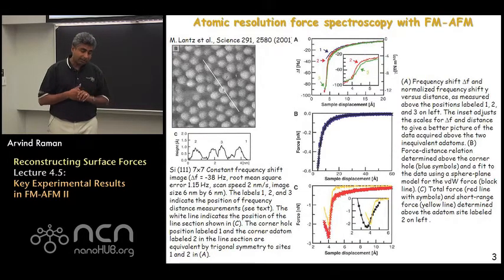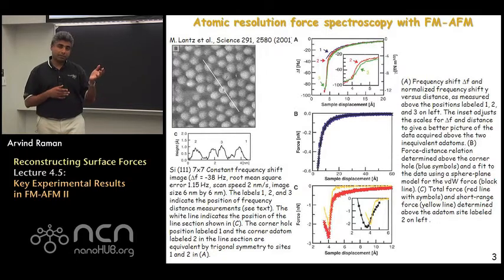So very soon after the images that we talked about in the last class started coming up, the key question came up whether or not FM-AFM could actually be used to come up with a quantitative estimate of the tip-sample interaction forces involved, especially in the case of surfaces which are reactive, for example, silicon 111.